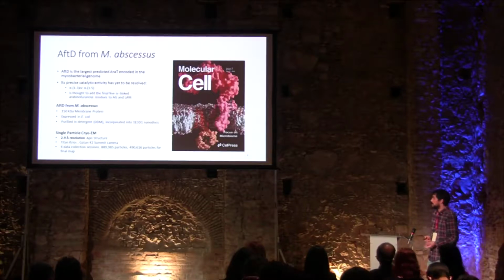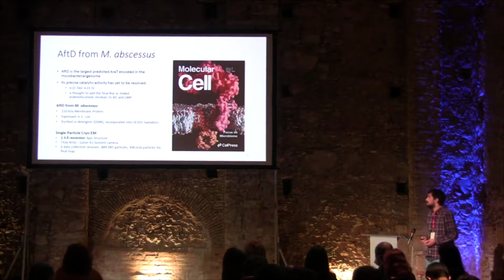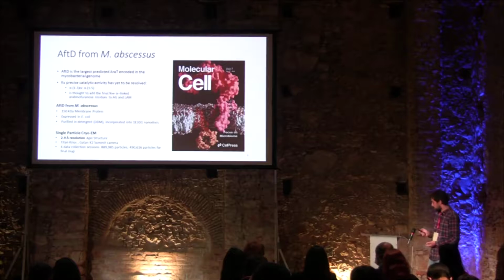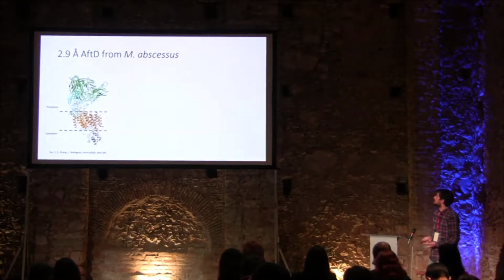size, and we expressed in E. coli, purified in detergent, and incorporated into nanodisk. And we used single particle cryo-EM to get the structure, because the yields of these proteins are very poor. So this work was in collaboration with Columbia University. We solved the structure with 2.9 angstrom resolution in a Titan Krios.